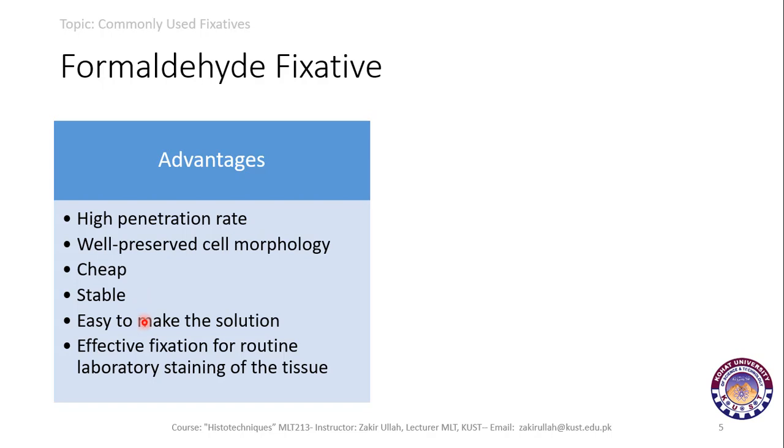The formalin solution is very easy to make from the formaldehyde solution, and it is an effective way of fixation for routine lab staining of the tissues.